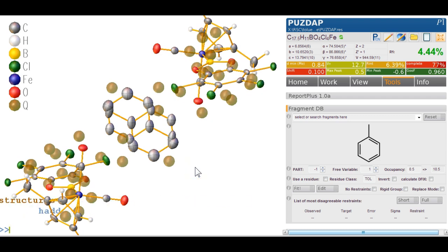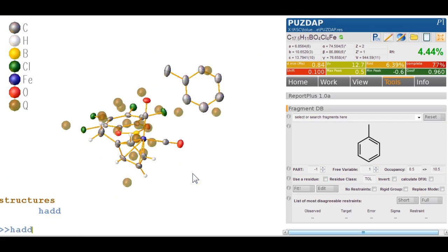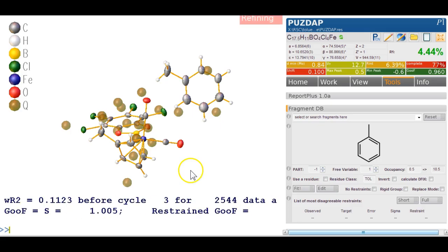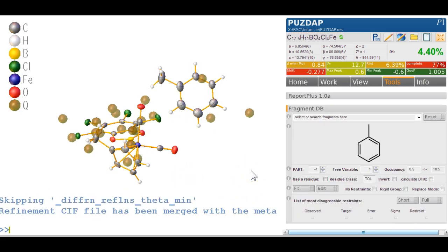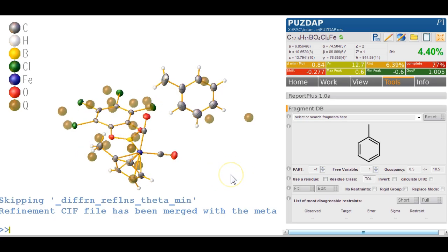H add to, it won't let me add hydrogen to this because it's a grown structure. So we need to type fuse first, H add and refine this again and we get a rather nice disordered molecule of toluene here.